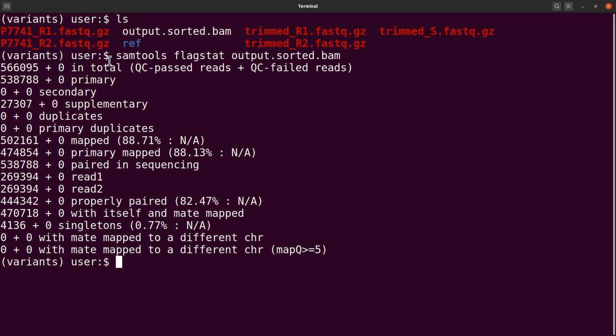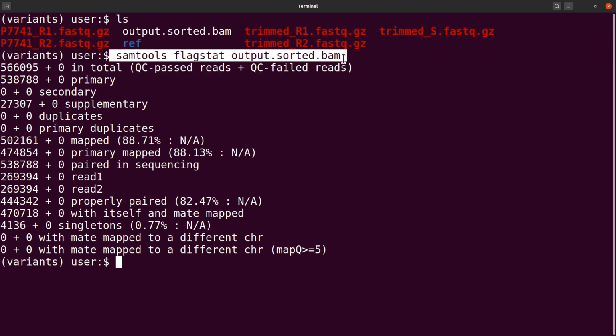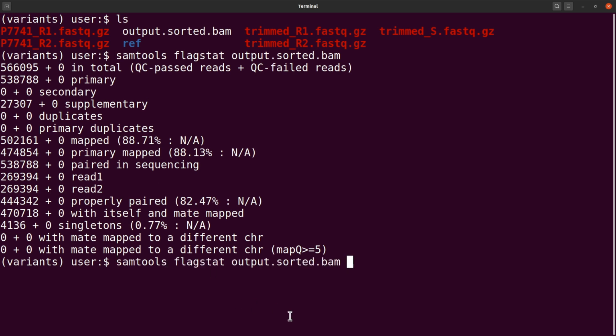So with this information here, you can also save to a text file. Maybe you want to make reference to it later on. You can just save it. Now it's just being printed for us on the screen. So to just save it, you can use the same command, and we just direct to a text file.